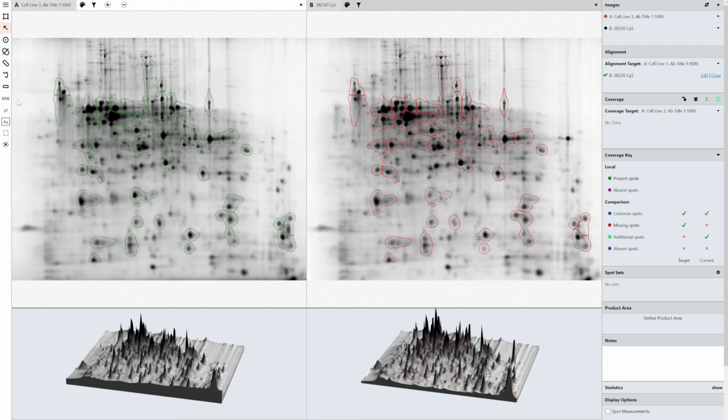Of course, you can always use the annotation function and draw it directly on your gel, and then include what you might want to include on there as a reference. That's normally used for specific areas of the image rather than the experiment. So if something went wrong, you could point to a section and say, accidentally tore the gel, or accidentally touched it with bare hands and there's a fingerprint on the gel, something like that, to explain that away.